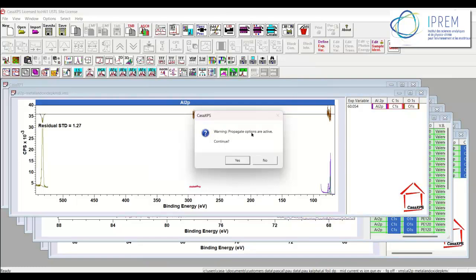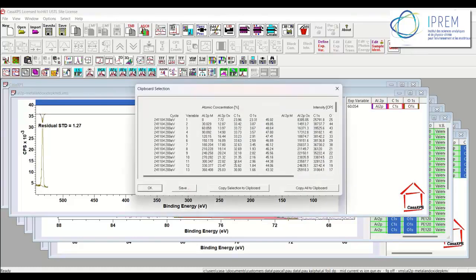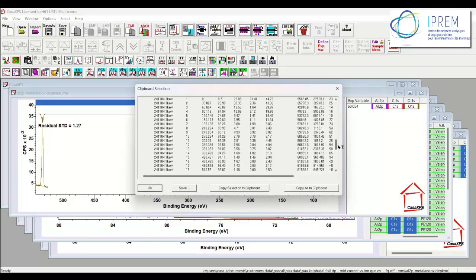So it's giving me a warning, and the warning is because perhaps you don't want to propagate when you're generating a report. In fact, typically you would propagate, then inspect, and then generate a report. So this is reminding you that you're doing quite an expensive operation in terms of propagating a lot of processing to a lot of files. We understand that is what we want, so we'll just say yes. And then off it goes, and it does the propagation and creates a report file.